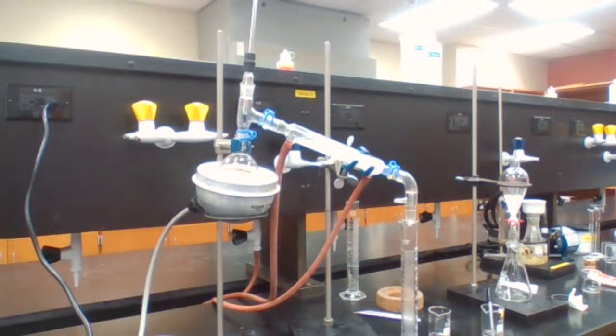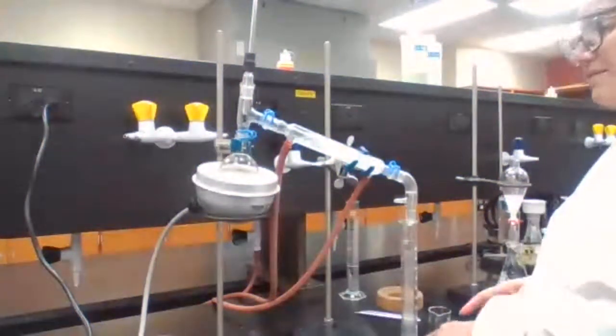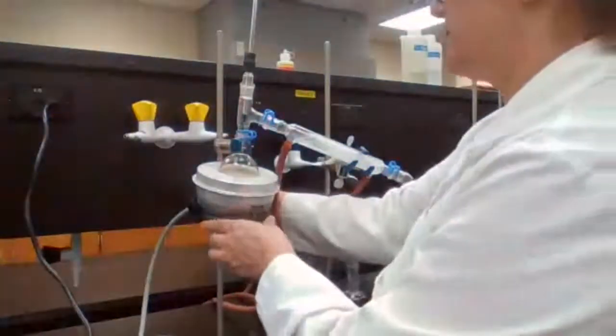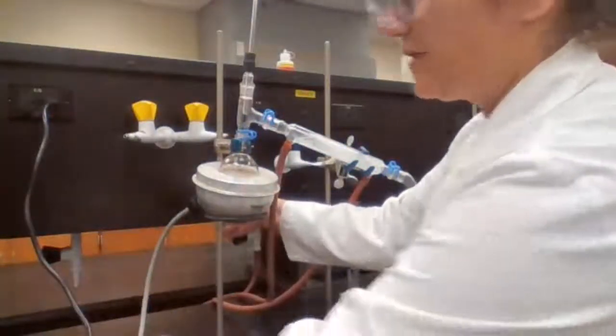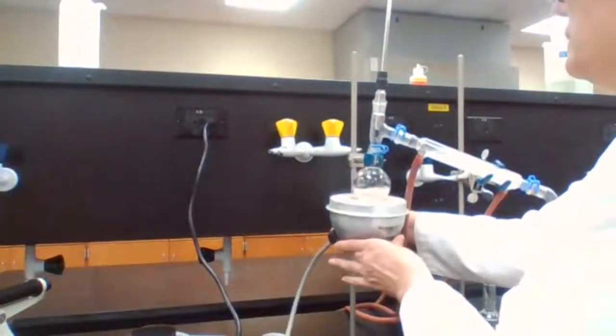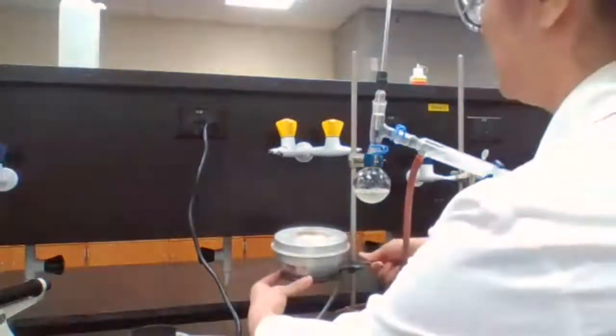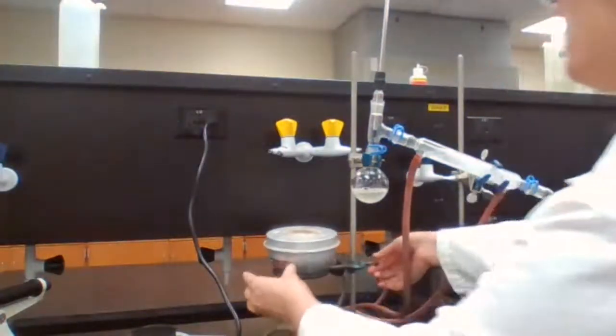So should I stop the distillation at this point? I think we have enough. I can stop the distillation. Turn off the heating power regulator. Lower and drop the heating mantle.